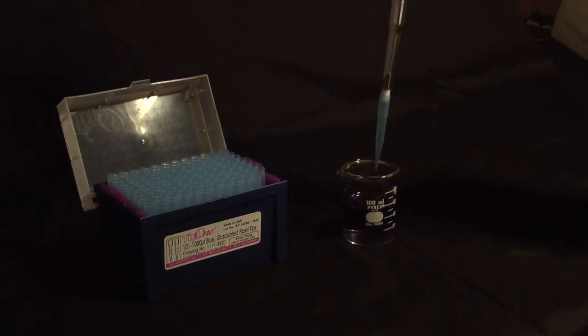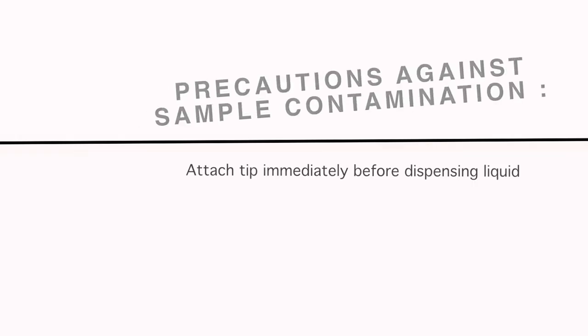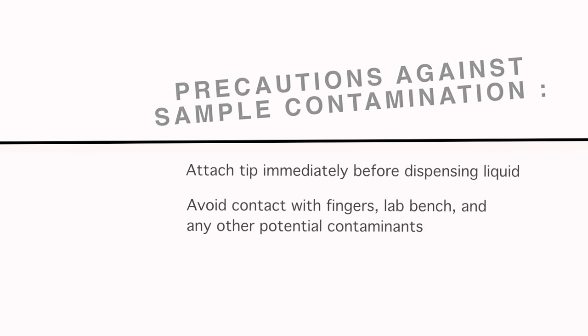Put the tip on the pipetter immediately before you are ready to dispense your liquid, and avoid touching the tip with your fingers, the lab bench, or other objects that might contaminate your samples.